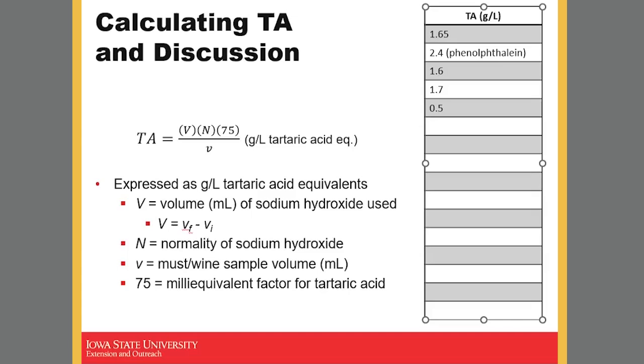If you don't calibrate your pH meter before doing any analysis, you won't have a correct value. So that's really the most important step in the titration: making sure the equipment you're using is calibrated correctly. If you have issues calibrating, go back to the recommendations or procedure for your specific pH meter, because they are all different. It's sometimes difficult to explain what to do, because you have different buttons to push and all of that.